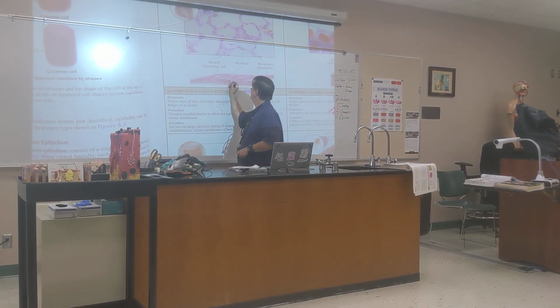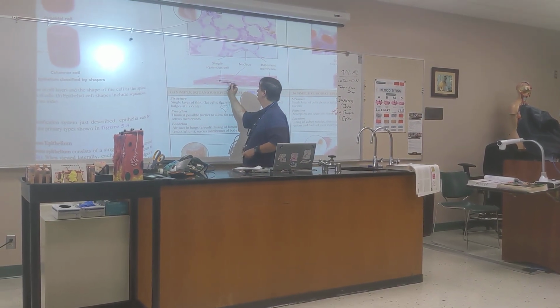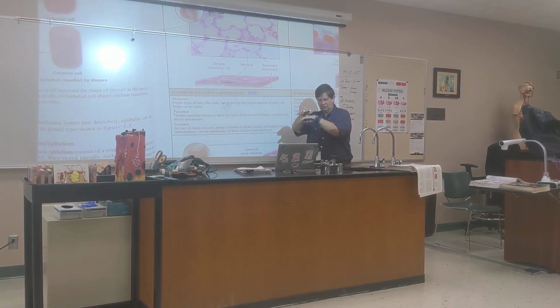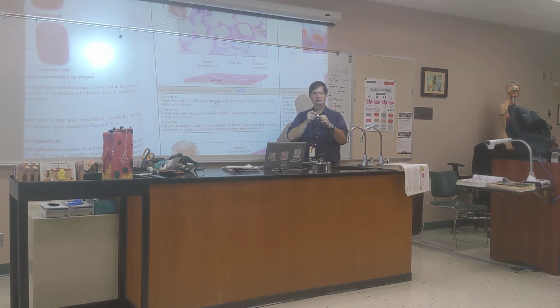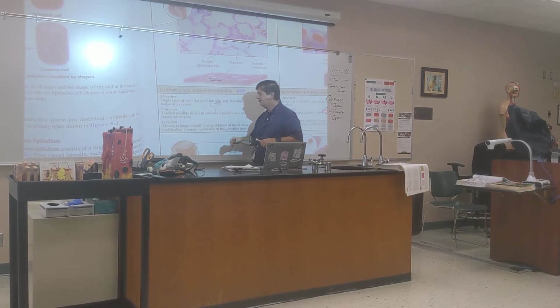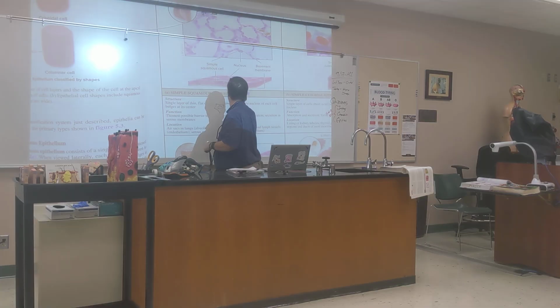In case you can't see it very well back there, I can change the contrast. But there's the nucleus. It's very squashed flat. Just like in the columnar, the nucleus is squished vertically. Does that make sense? Everybody good? All right. So this is simple squamous.